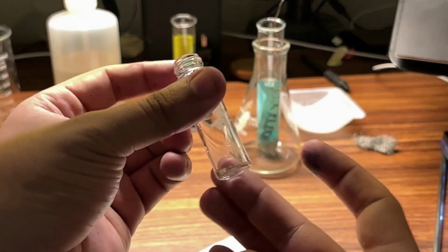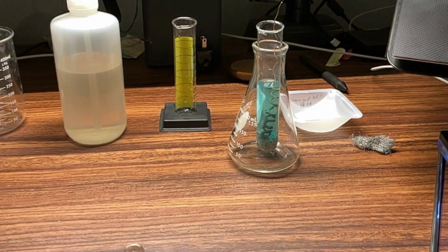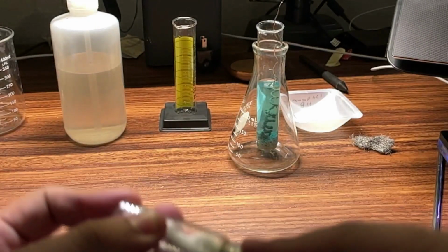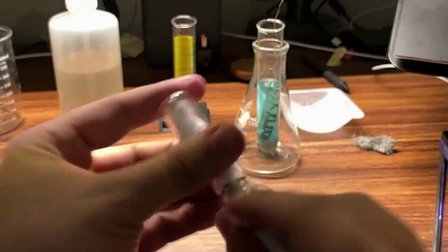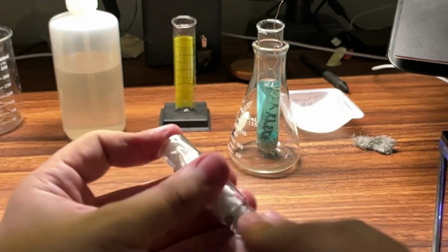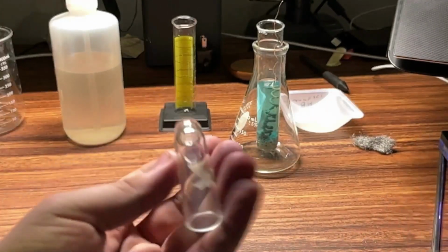One thing that I'm noticing, though, is I can't put this vial right on the balance right now because there's water in there. And I don't want the mass of vial plus water. I want the mass of the vial. So I'm going to dry that real quick before I take the mass. This isn't a step that was in the procedure, because in the original step, I didn't account for the fact that maybe we couldn't get all of the silver nitrate out of the vial. I didn't think that would happen. So, actually, I think I'm going to get better results than any of the groups that are doing it today.